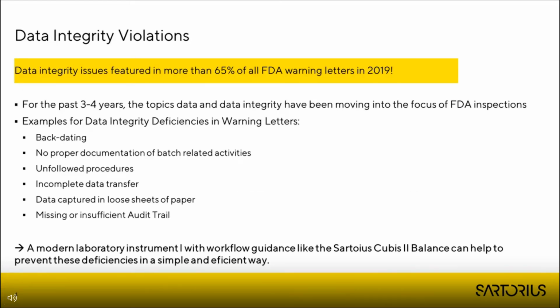So data integrity is a hot topic in the pharmaceutical industry. You can also see this when you take a look at the FDA warning letters. For example, in 2019, 65% of all FDA warning letters contained data integrity issues, and these are different types of issues.